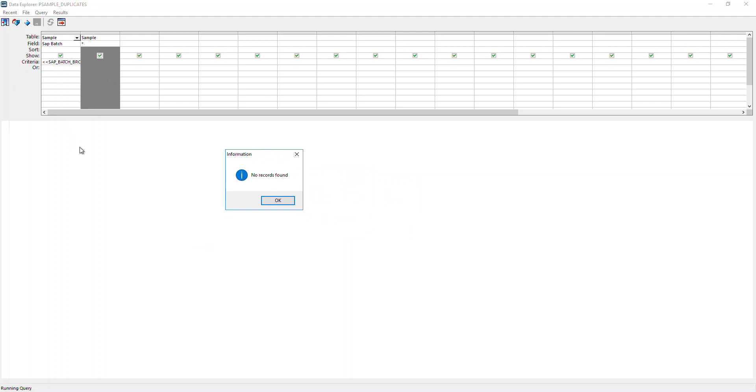You see there are no records that are duplicates - wonderful. If there were, it would list just those records that are duplicate, and we'd have to keep those in mind, maybe take a screenshot or copy the list. Great, we're done with that.